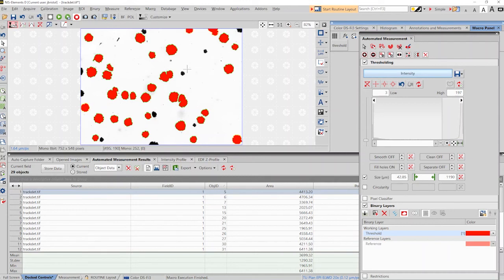Now, we specifically set this up so that we're missing a few things. And what you're missing here is we still have some things touching the border that have not been excluded. So we can just very quickly make some slight adjustments here and see that, just by a slight adjustment of our thresholding, we now have all of our objects touching the border going to be excluded.